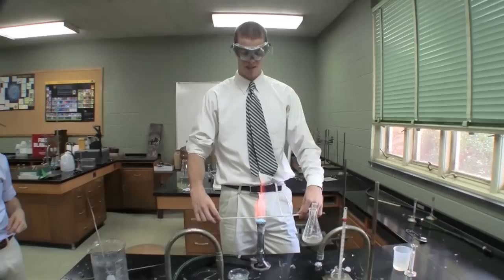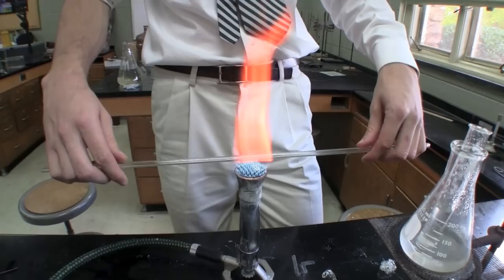Hey guys, what are we doing here? We're superheating some glass and we're making capillary tubes. We're going to make a capillary tube — a Marshall size capillary tube.